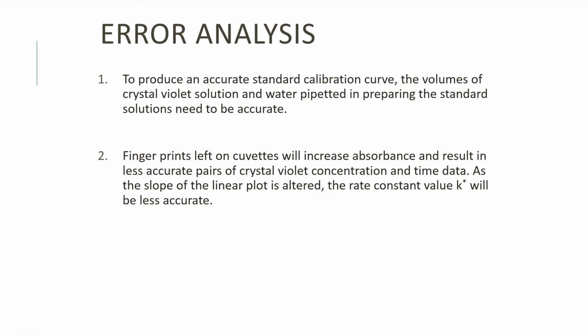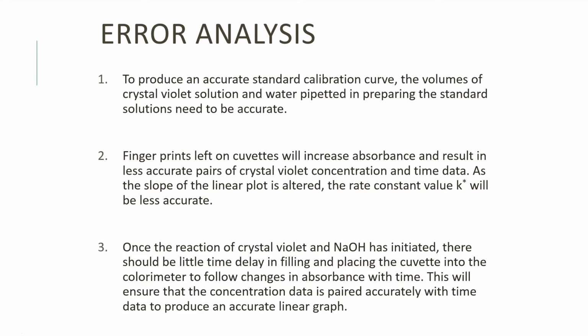Also, once the reaction of crystal violet and sodium hydroxide has initiated, there should be less time delay in filling and placing the cuvettes into the colorimeter to follow changes in absorbance versus time. This will ensure that the concentration data is paired accurately with time data to produce an accurate linear graph.